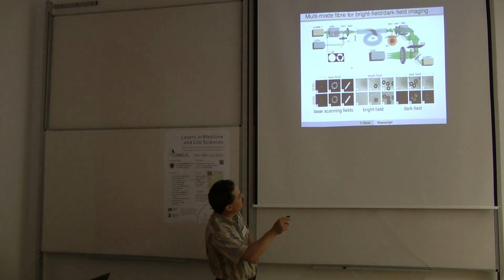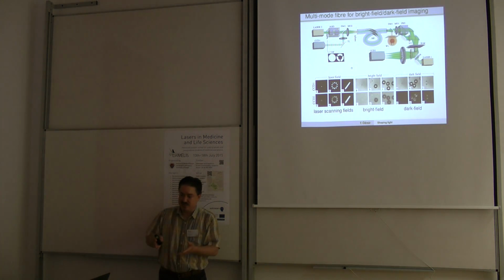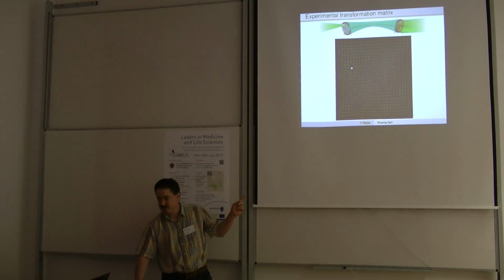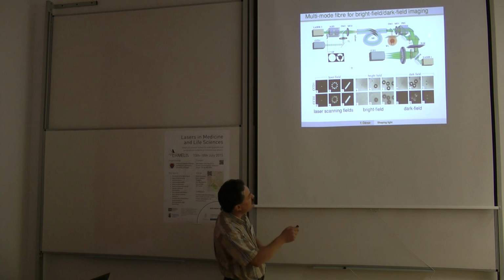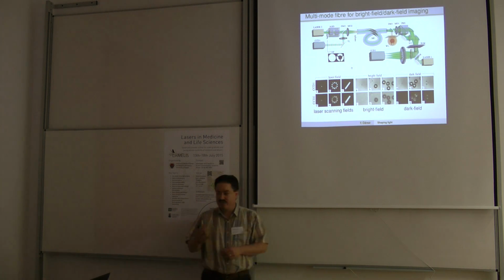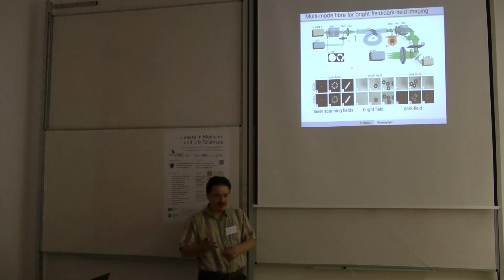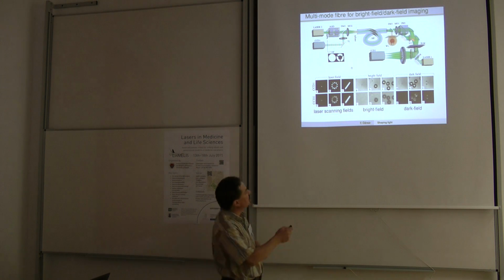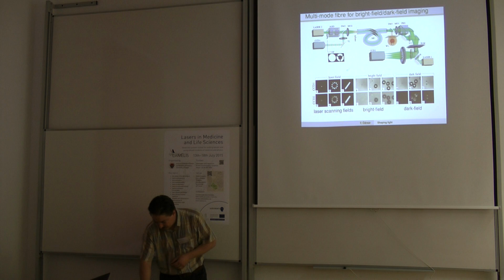We have a multimode fiber that gives me a transform. It's not a Fourier transform. It's some kind of bizarre transform that is described by this transformation matrix. Right? And then I have all these optics, including a spatial light modulator, in order to program it efficiently so it works just as the tube lens. And when I do that, I can sort of invert the randomization of the fiber and get an image again on the CCD. Right? So pretty much the same thing.